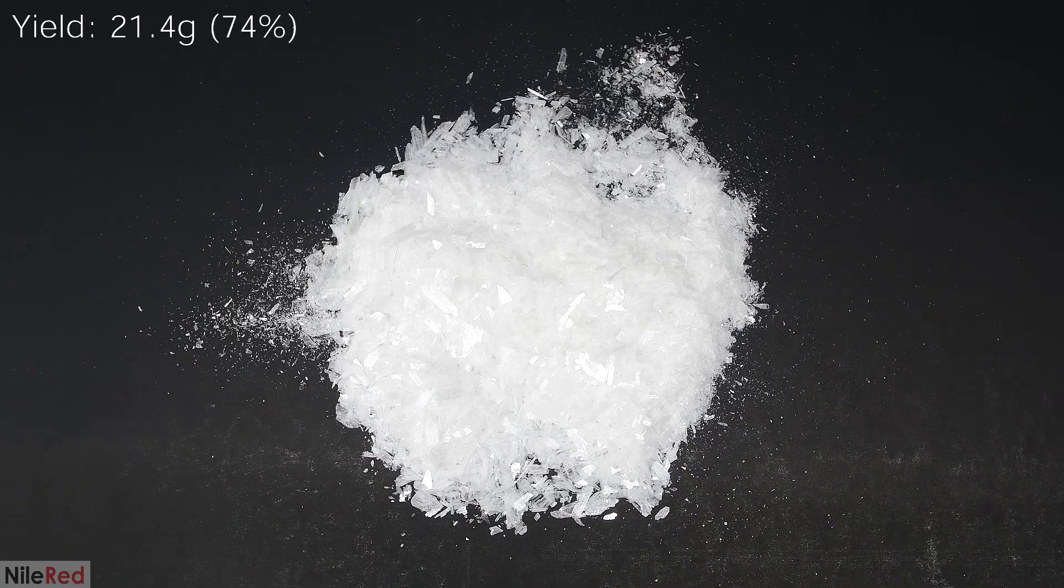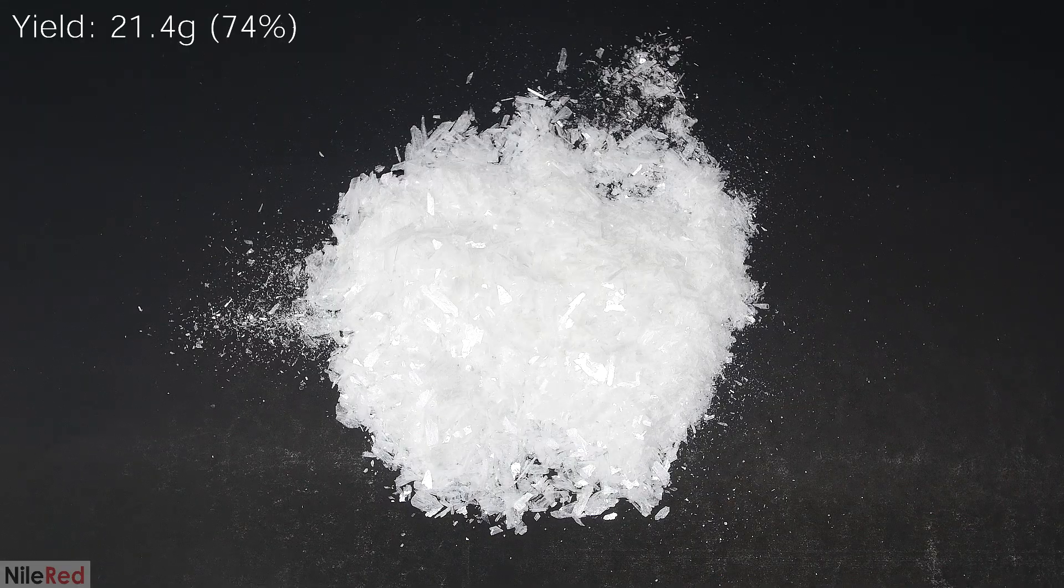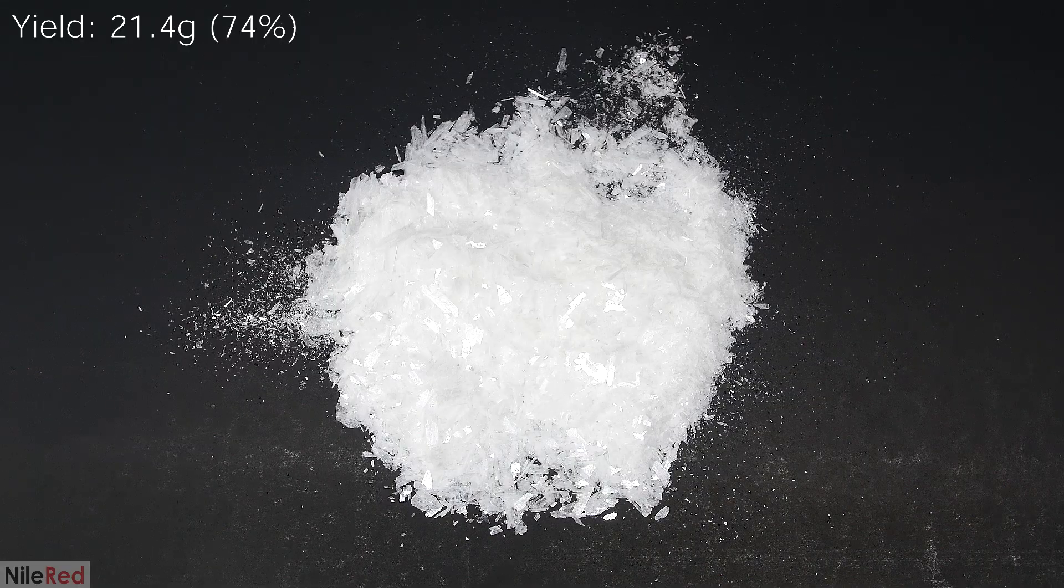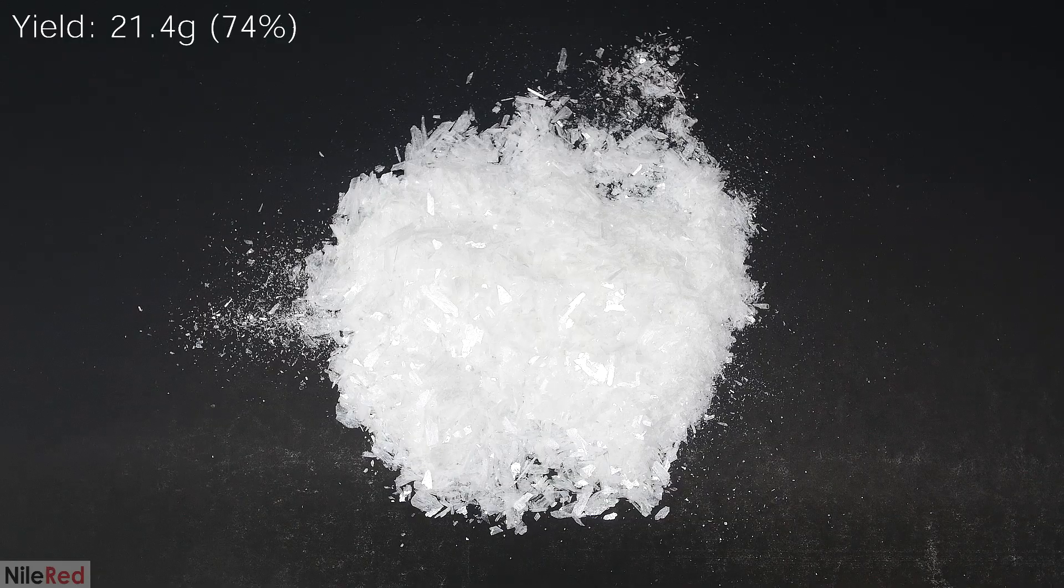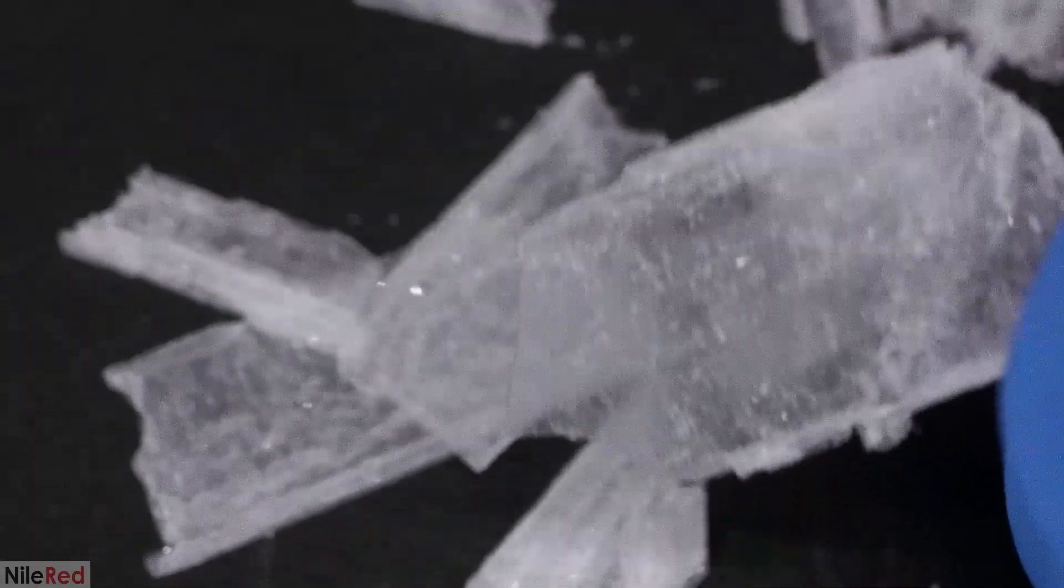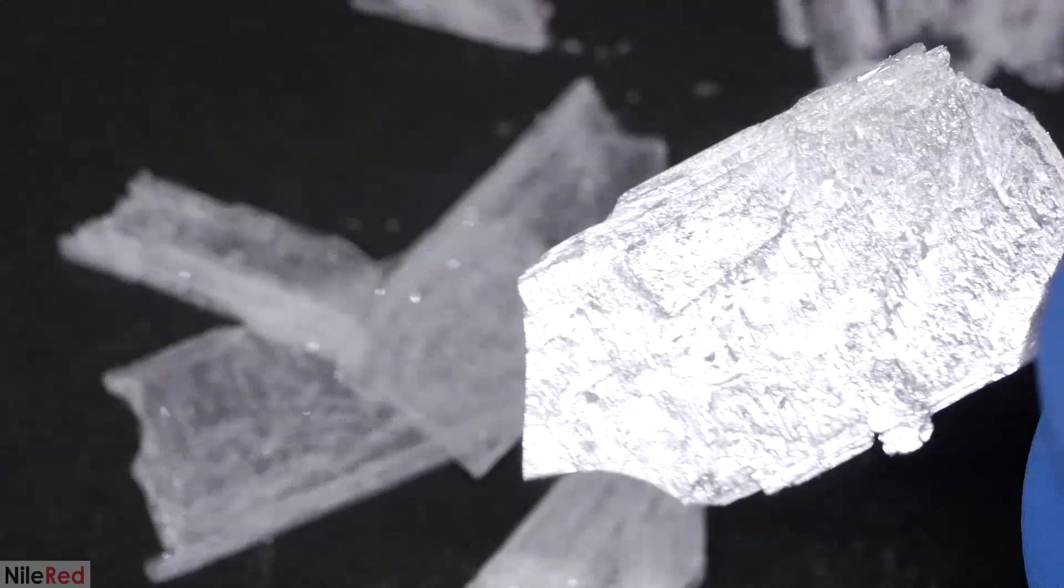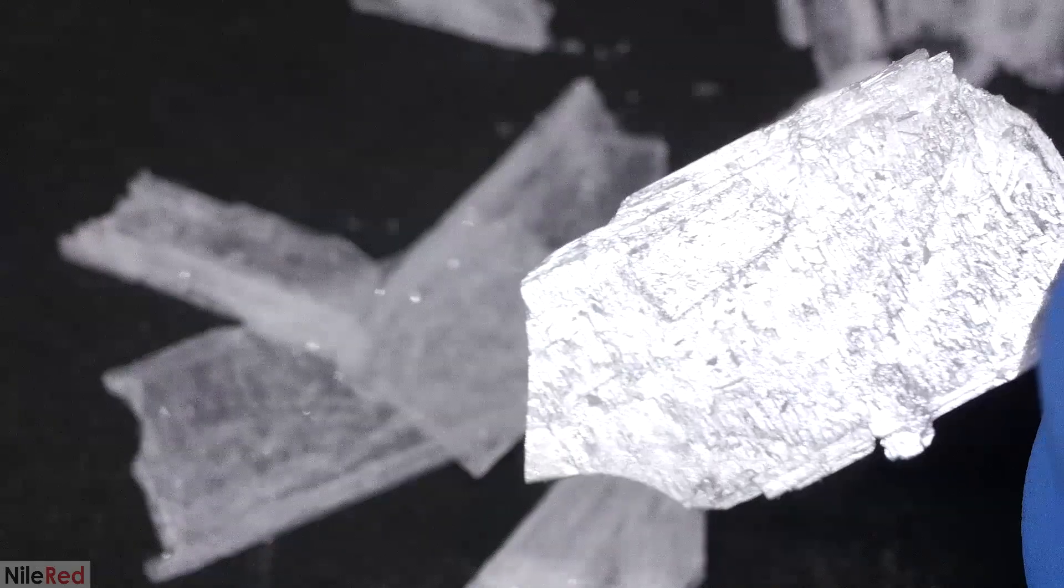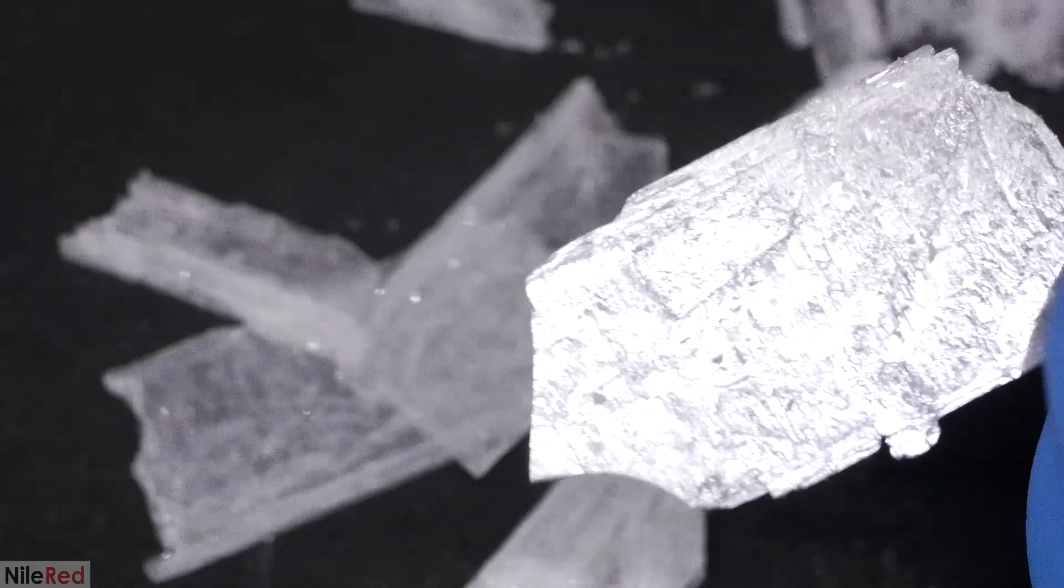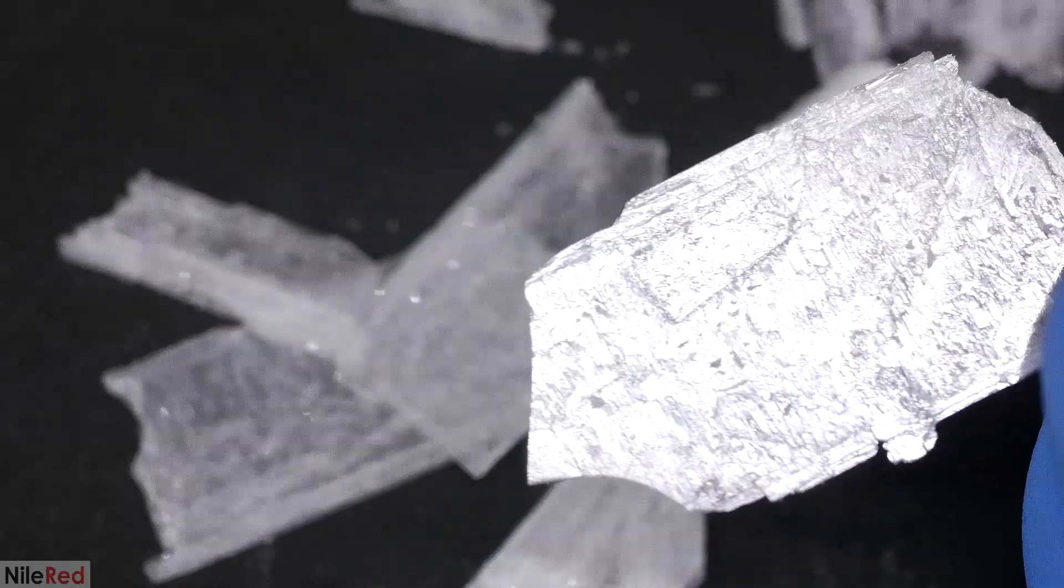The final yield of nice acetanilide crystals is 21.4 grams, which corresponds to a percent yield of 74%. I picked out some of the nice crystals and zoomed in as much as I could. When it's tilted on the side and I'm able to catch the light, we can see the surface texture of the crystal. I honestly don't have too much to say about this, I just thought the close-up was kind of cool.